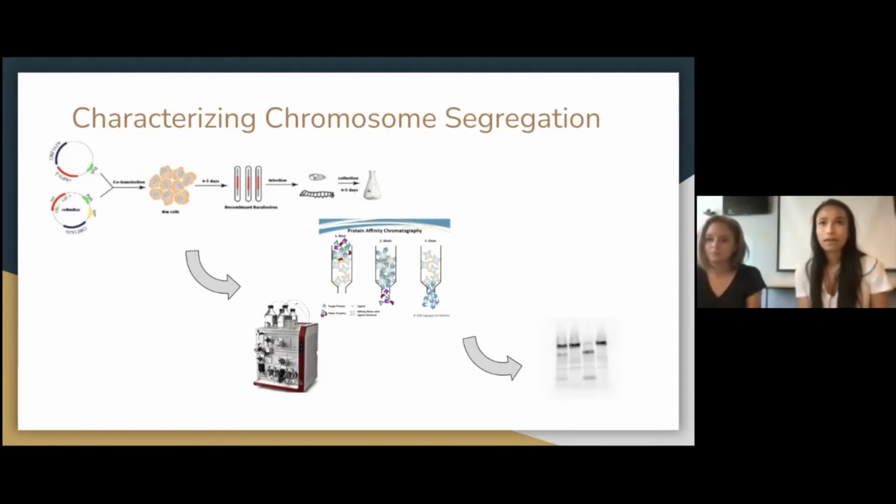And so basically my job is to use these proteins in different biochemical assays to be able to evaluate their activity and characterize them better. In order to do these assays, we need a large amount of these proteins. To express them, we use both bacteria and insect cells. And to express proteins in insect cells, we use what's called the baculovirus expression system.